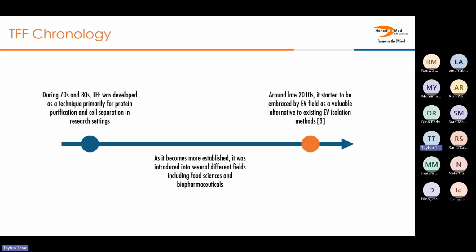But it was only around the late 2010s that it started to be embraced by EV researchers as well. And it is also worth mentioning that now in MISEV guidelines, tangential flow filtration is also mentioned as an alternative method for EV concentration.